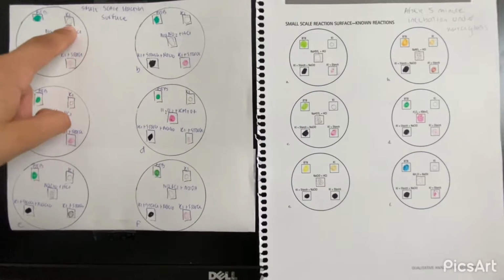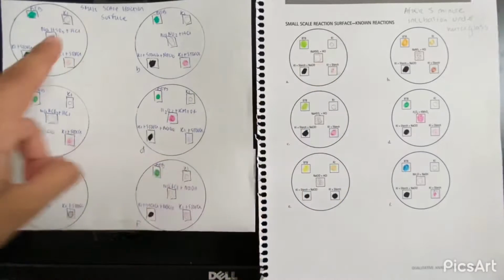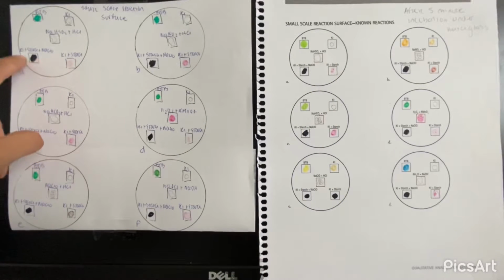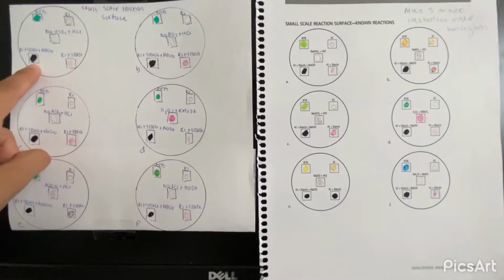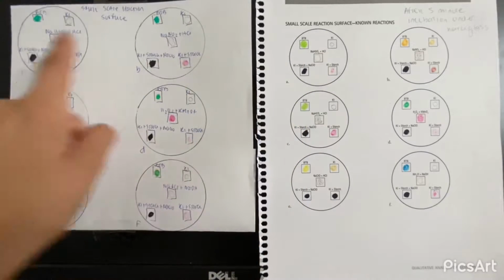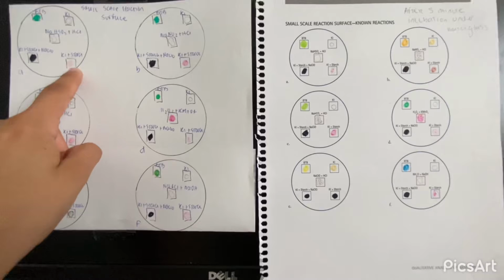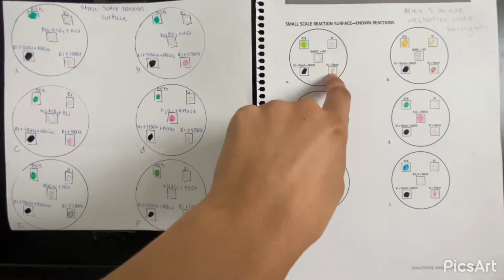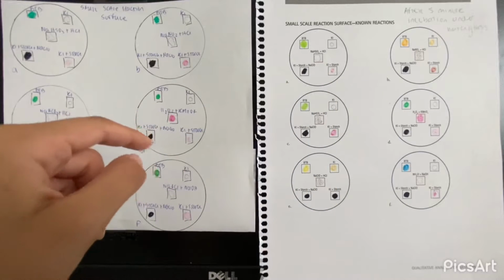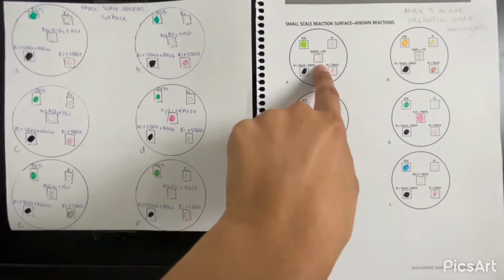Then for the KI, we have a colorless solution that has no change. For our KI in starch and the NaClO, no change. Again, we still have the dark black before and after. For the KI in starch, we have a light pink, and after the 5 minutes, we have a strong pink, like in the middle. And for our chemical reaction, we don't see any bubbles.